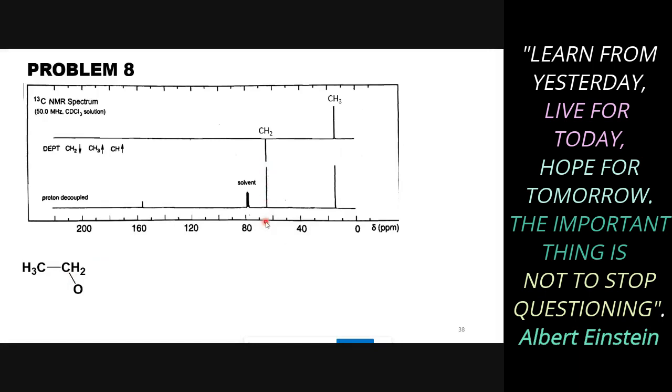So if you look at this signal here, you can see it's about 62 to 63 ppm here. This is 40, 50, 60, and this is slightly above 60. So it could be 63 or 64 ppm. And that is a confirmation that we have a CH2 next to oxygen.